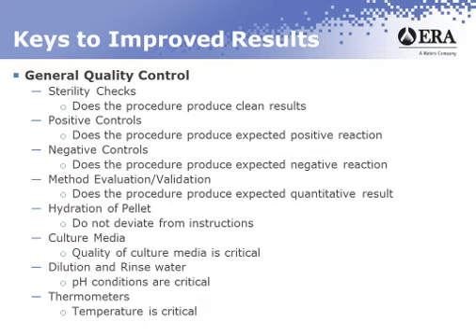Opening and closing the door of incubators. Depending on what size they are, you're going to have a refresh time. When you open the door, the temperature is going to drop, and it's going to take a certain amount of time before it ever gets back to the incubation temperature. You want to have an idea of what that time is, so that you can compensate your incubation time based on the period of time where it's not actually at the incubation temperature. So get an idea and avoid opening up the door as much as possible.